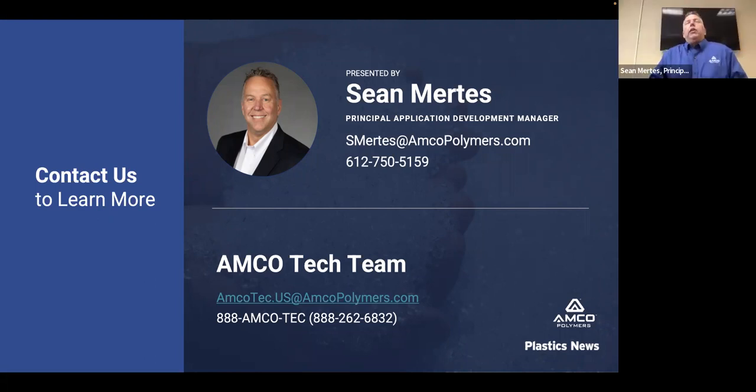Polypropylene, polyethylene, and TPO are probably a little bit more of the unique, more difficult ones to do, just because the glass transition temperature is below room temperature. It's a very steep curve all the way from room temperature all the way till my Tm. And that's what I want to do. I want to quantify and qualify what that slope is.